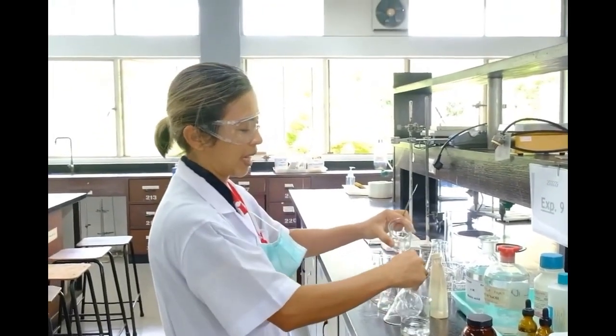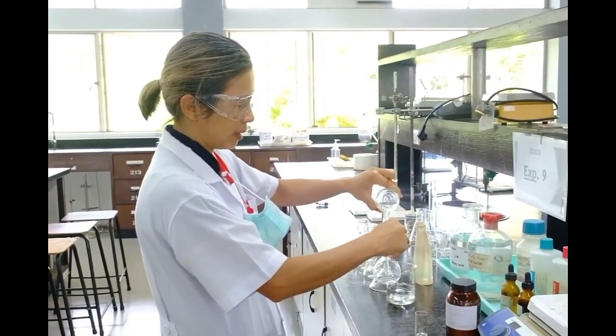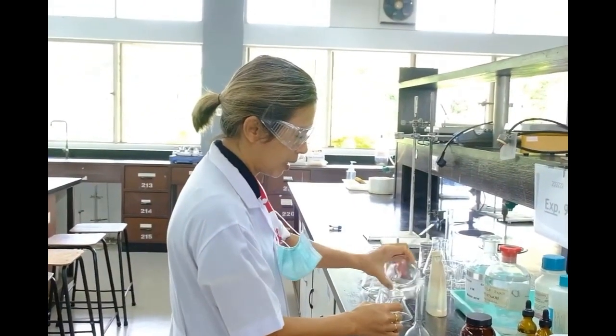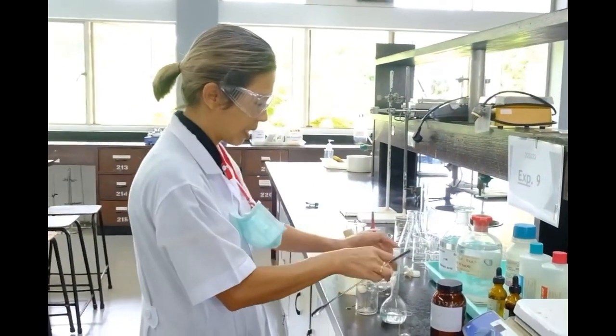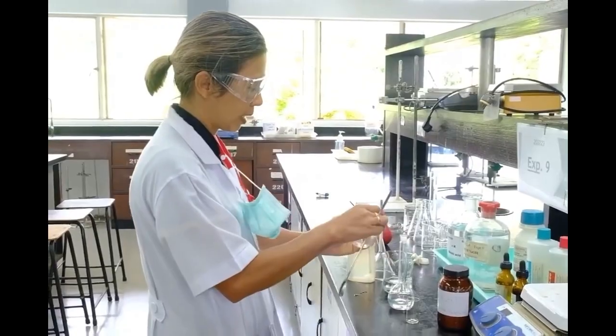The pouring technique involves tilting the flask once, leaving some solution above the beaker to check for any remaining residue.